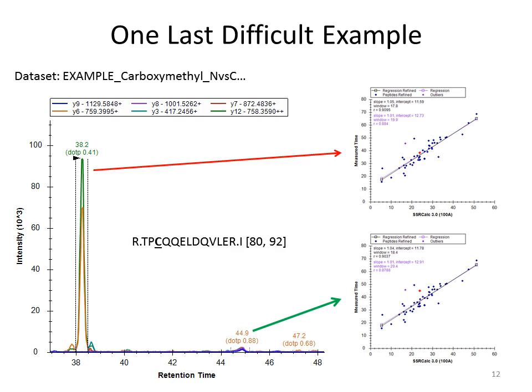Yes? Can you reorient me really quick? What we're looking at is actual raw data that we generate. And then it's compared with this spectral library. Not a theoretical spectral library, it's an actual spectral library generated. So the spectral library was generated from high-res accurate mass data, searched against a database, and then if you go into the view in Skyline, you can see the spectra, for all of the peptides that would be in there.